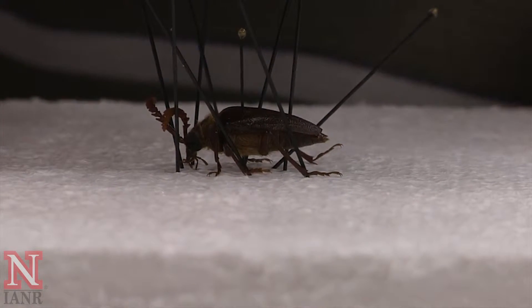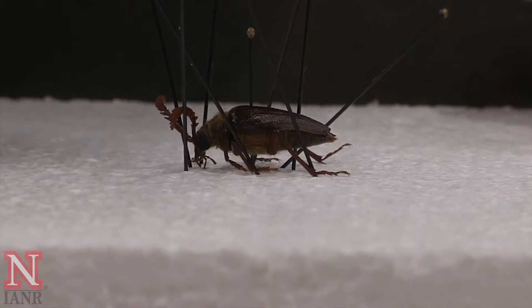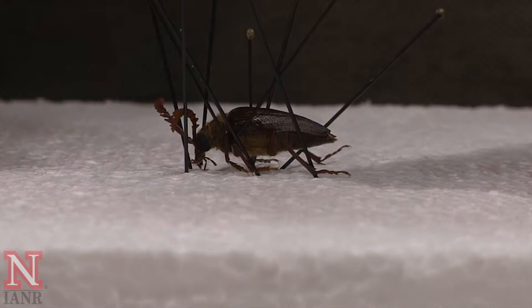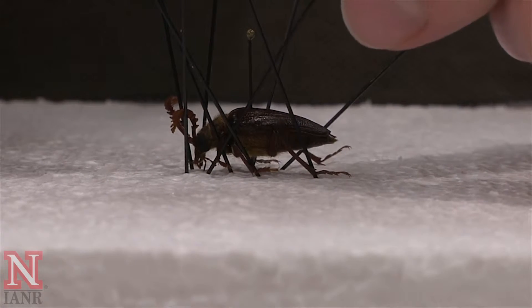Occasionally you may have a leg that is difficult or refusing to go where you want it to be positioned, and a second pin can be quite useful to get that leg into the position that you want.